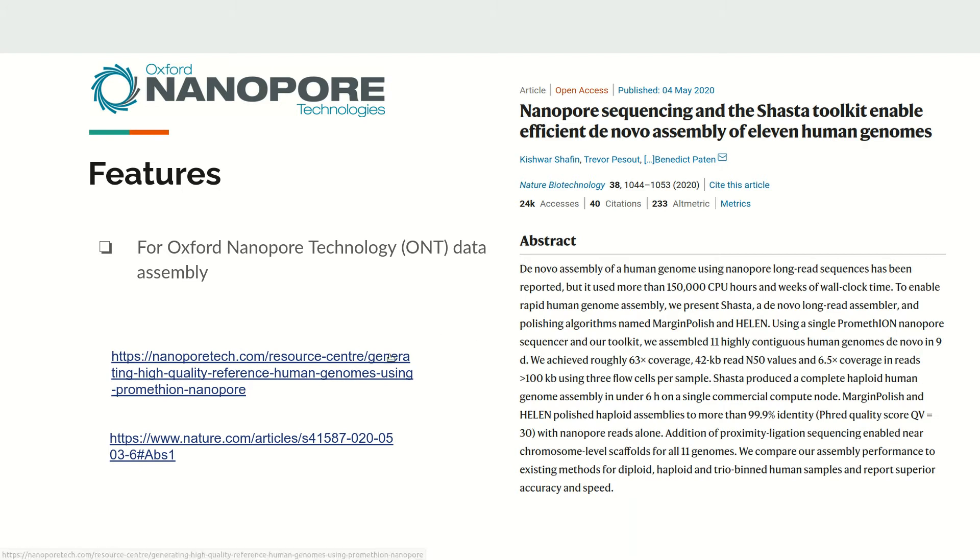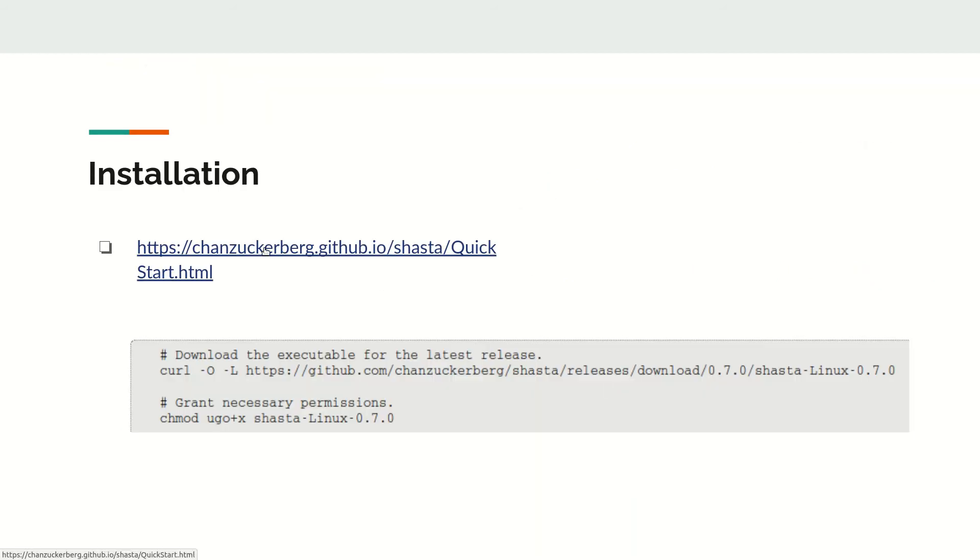If you want to know more about the paper, there is a nice video available at the nanoporetech.com resource center. For installation, the tool is available in binary format, so you can directly download it using the curl command and then make it executable. There is no need for a full installation — you just download the binary file and use it directly.